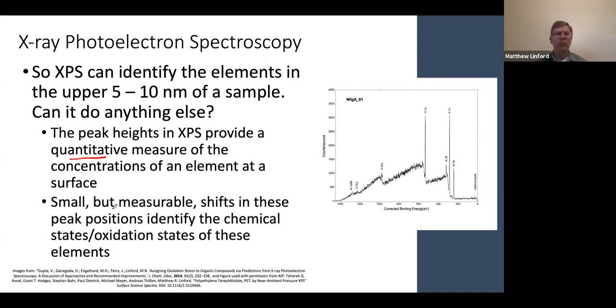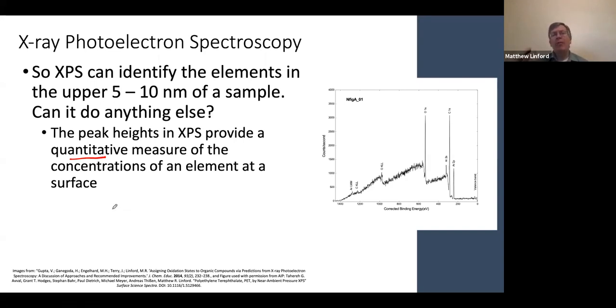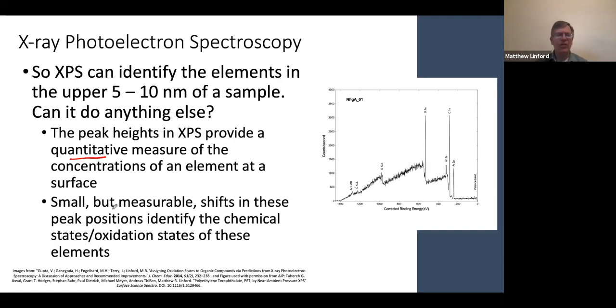Again, very important information. And I do want to say as an aside that the bulk of a material is not the same as the surface of a material in most cases. Even if you know the bulk composition of a material, it's unlikely you know exactly what the surface material is, especially since surfaces change, they oxidize, they contaminate, et cetera. So if you know the bulk, you might be surprised when you take a look at the surface. There's something else going on here.